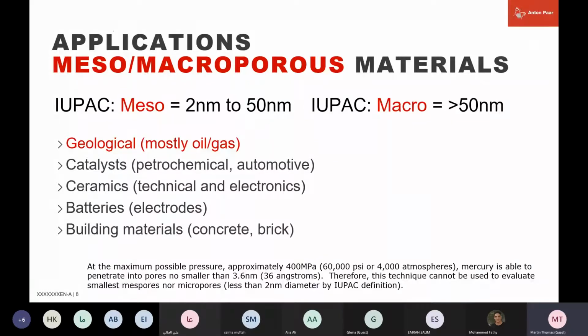So smaller than 100 nanometers, yes, we can refer to those as nanopores, which includes 50 nanometers' worth of macropores and all of the mesopore range. So this is the range that we're covering. And again, it's a very wide dynamic range.